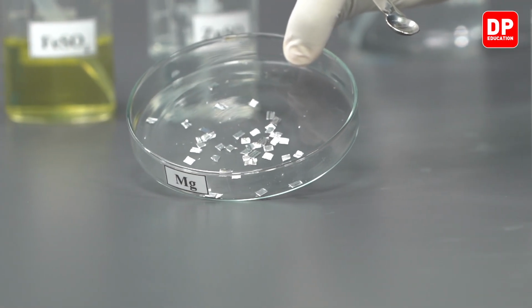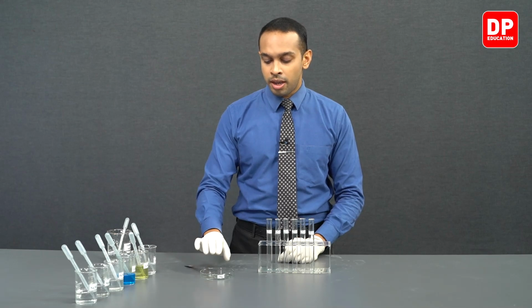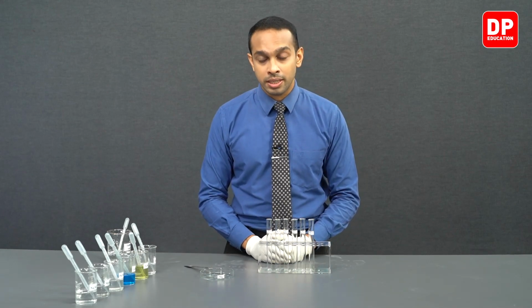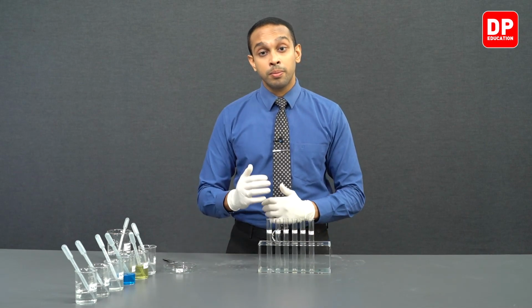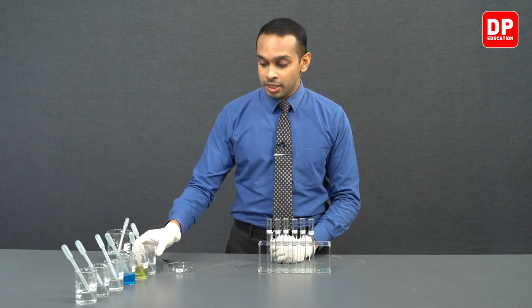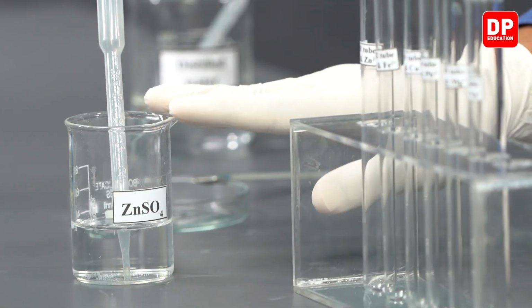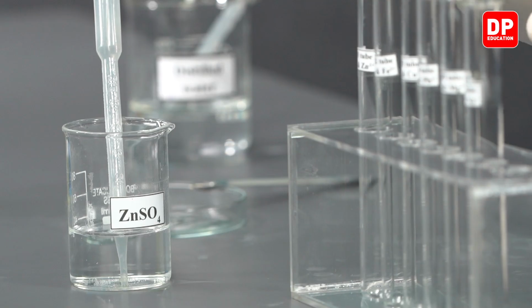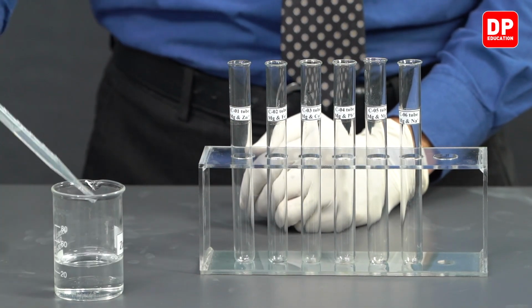So after cleaning the magnesium metal, we will cut it into pieces, and we have obtained our magnesium metal pieces here. And like we did in the previous parts of the test, we will take each of these solutions and transfer around 5 milliliters of these solutions into each of these test tubes. So let's go ahead and do that.